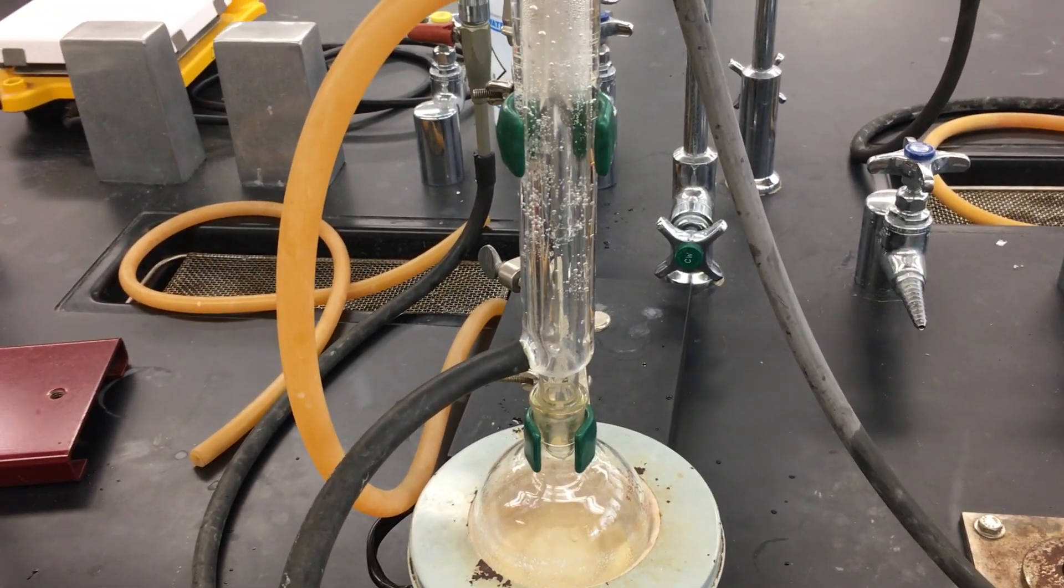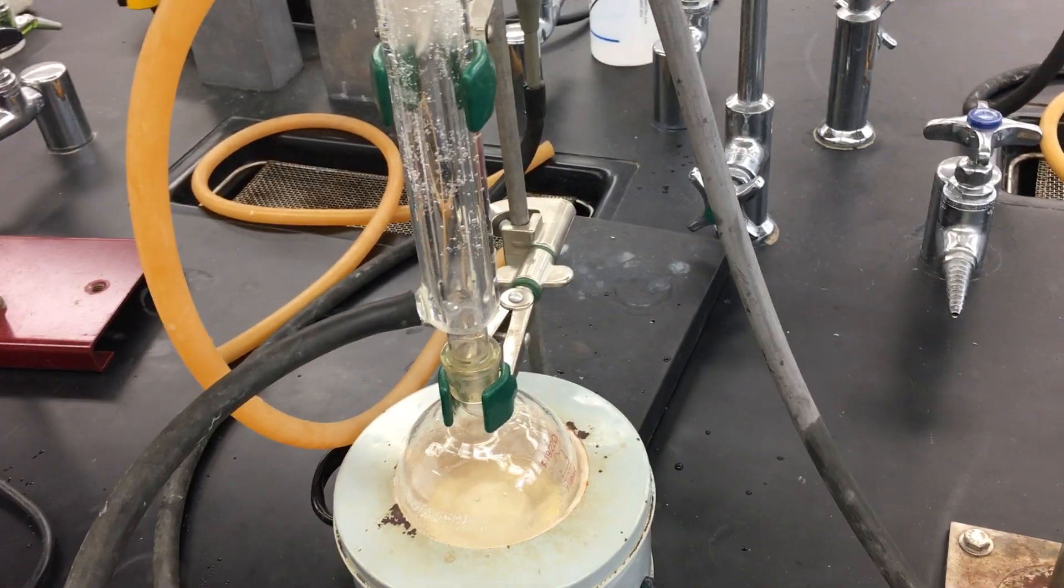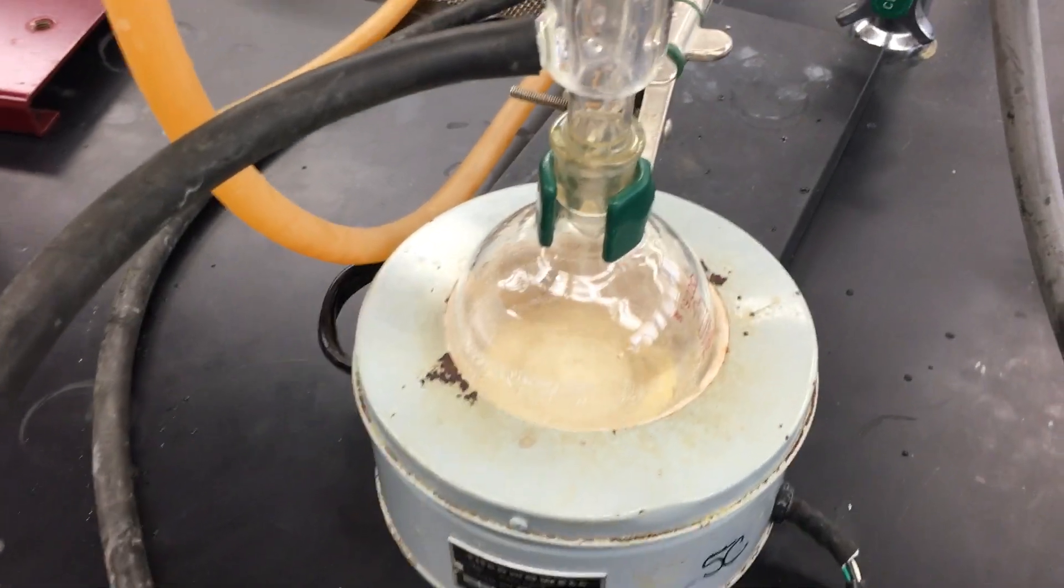So what do we expect to achieve in this step of refluxing? What are we gaining through this step?